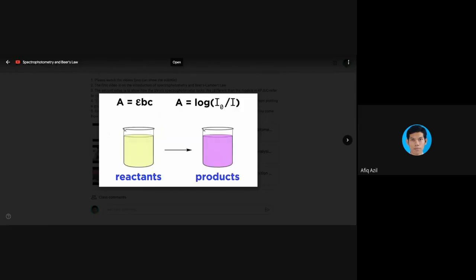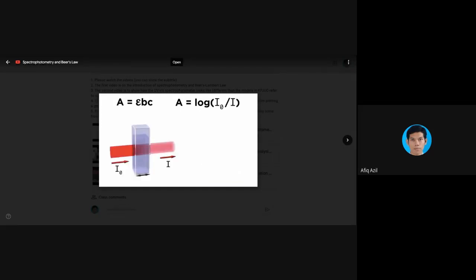The primary advantage of this technique is that we can just let a reaction occur normally and measure the rate indirectly by analyzing the light that interacts with the components in solution, rather than stopping the reaction and measuring concentrations directly. Let's try one calculation.